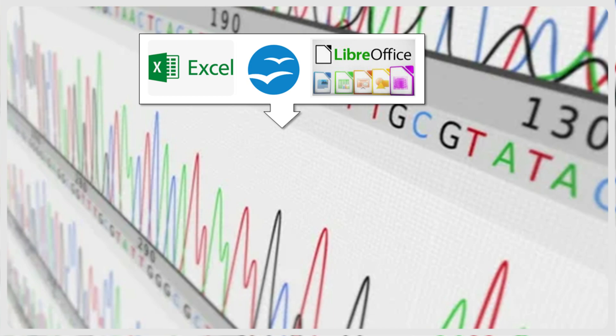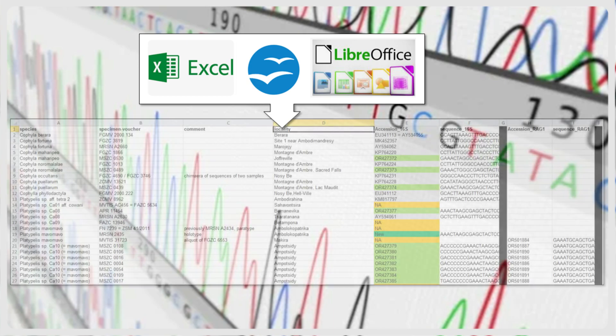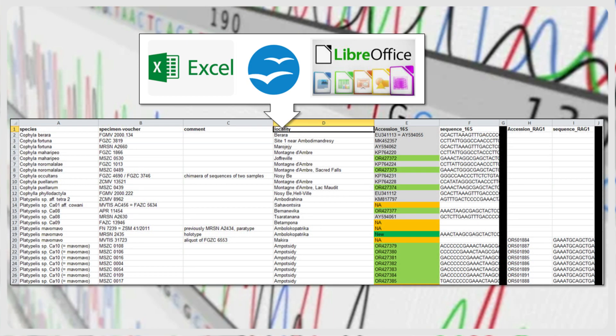Of course, for large sequencing projects, you may prefer to manage your sequences in dedicated databases, or as part of a barcoding project in the BOLD database. But even then, spreadsheets can be useful for specific analyses, where you want to combine your sequences with others retrieved from GenBank.